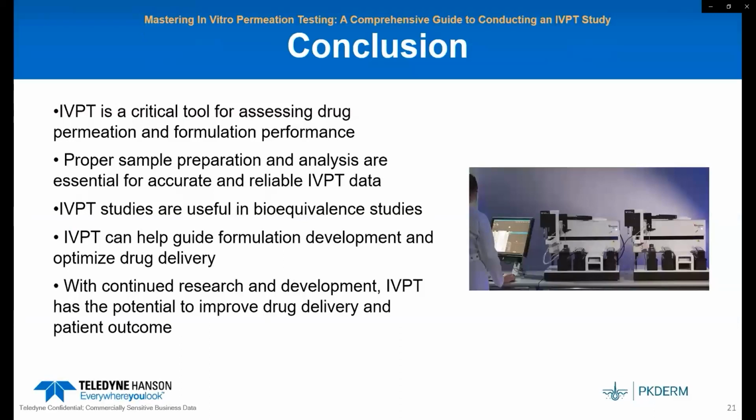So in conclusion, we saw that IVPT is a critical tool for assessing drug permeation and formulation performance. To obtain accurate and reliable IVPT data, proper sample preparation and analysis are essential.